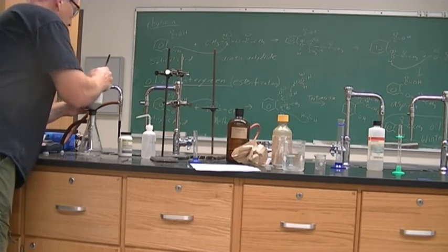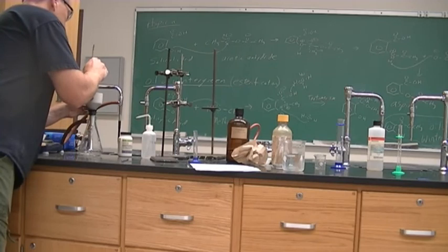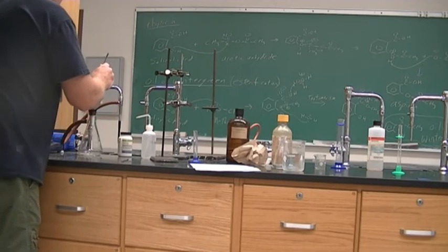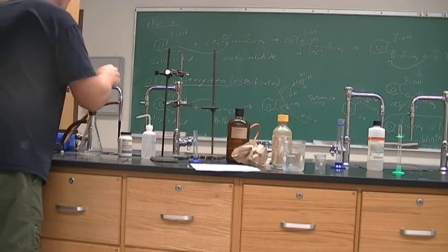Solid, looks very nice, just like it's supposed to look. Now I'm going to scoop it into here.